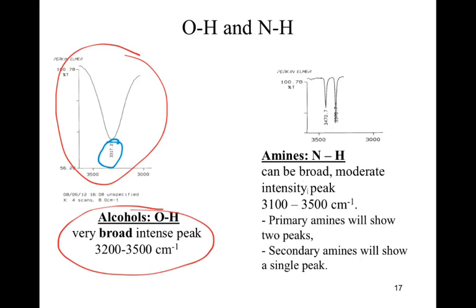If we take a look at the amines, again, we could go through and evaluate the description in words. Not easy to go through and pick out, but maybe if we take a look at the image, we can see a little bit more cleanly what's going on. I will note that the amines are very tricky in the respect that sometimes you'll see them as sharp, sometimes you'll see them as broad. They will never, ever, ever be as broad as the OH. Your alcohols are always a much broader peak. Just be aware of that.